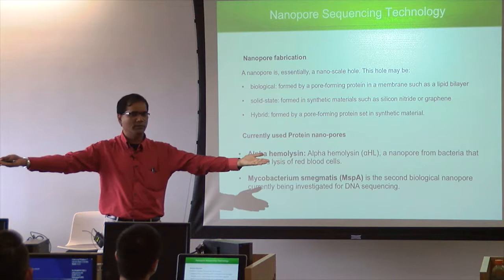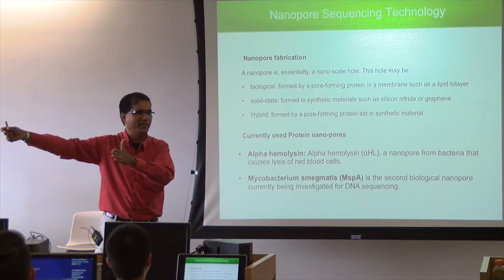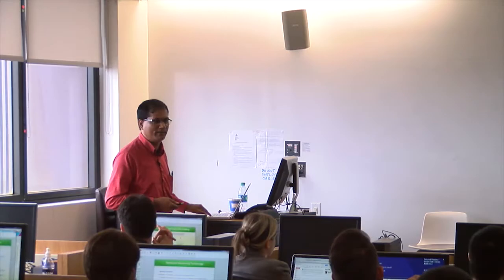Synthetic, and then getting inspiration from the biology, from the structural chemistry in nature, carbon chemistry, right? And then look for the proteins which can form pores. So these two proteins were detected. People found out that these could be very good to start the membrane. Isn't it a cool idea? Good? Excellent, right? Revolutionary, right?